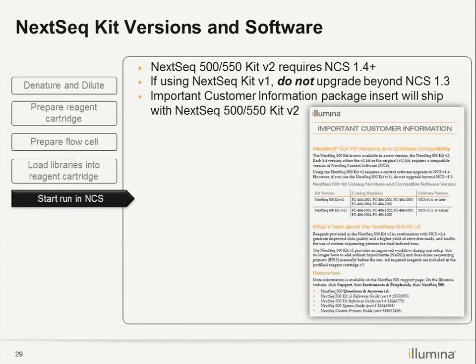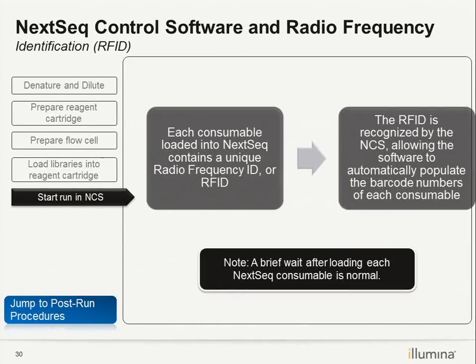Okay. This is just a software compatibility issue, but I don't think this is an issue anymore, because it was during a transition state that we had customers running both version 1 and version 2 reagents, and they had some software compatibility issues. But since now version 1 is discontinued, this problem is gone.